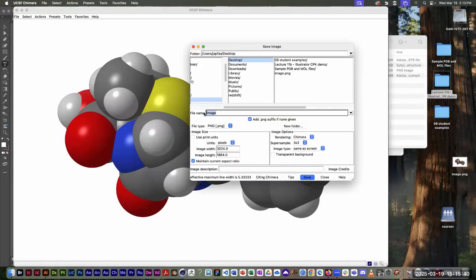And I forget, I think this is penicillin. Penicillin, they're missing an I. And so the file type doesn't really matter that much. I mean, I wouldn't use EPS, but JPEG, PNG, even TIFF, pretty much any of those should work.